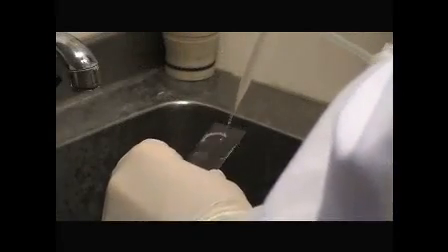During incubation, epoxy-modified glass cover slips are cleaned in the same way. After inking, the stamps are washed with PBS and water.